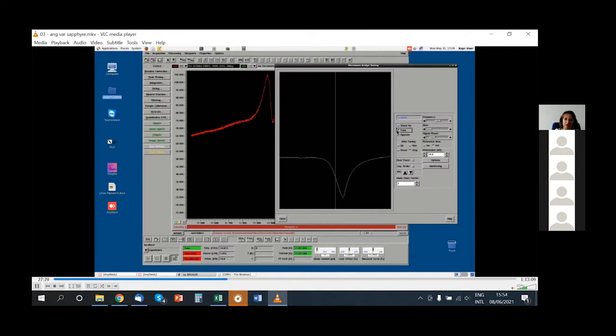So in nanostructured materials, you have like a powder spectrum. You shouldn't see the lines moving by rotation. So we are now sure that the manganese 2+ lines are from the film, as they are not moving by rotating the sample.